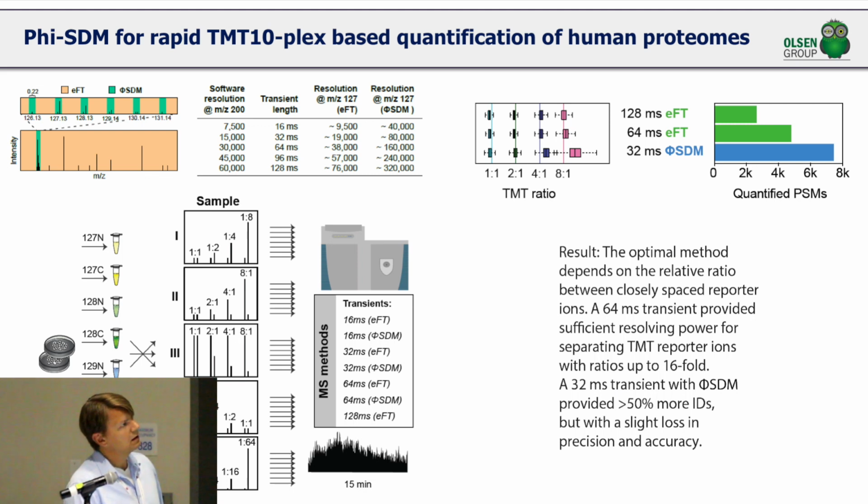with this feature. And as you can see, that directly translates into an increased number of peptides and PSMs when we can scan faster on the instrument.